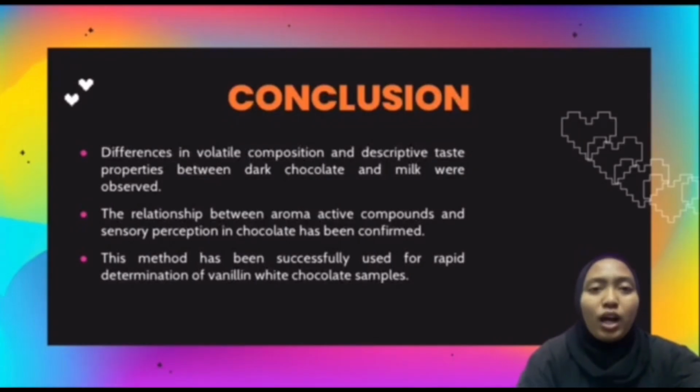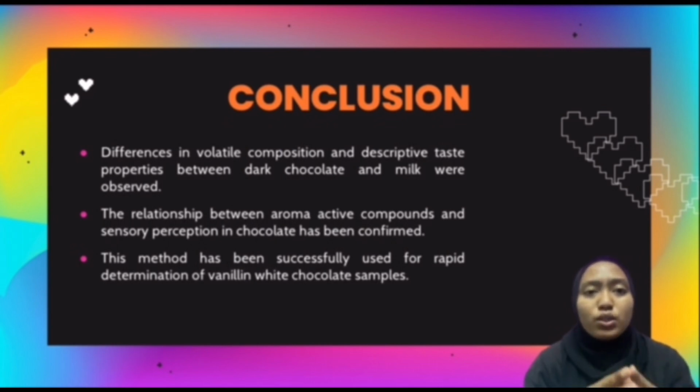For my part, I will be talking about the conclusion of this experiment. Differences in volatile composition and descriptive taste properties between dark chocolate and milk chocolate were observed. The relationship between aroma-active compounds and sensory perception in chocolate has been confirmed. This method has been successfully used for rapid determination of vanillin in white chocolate samples.